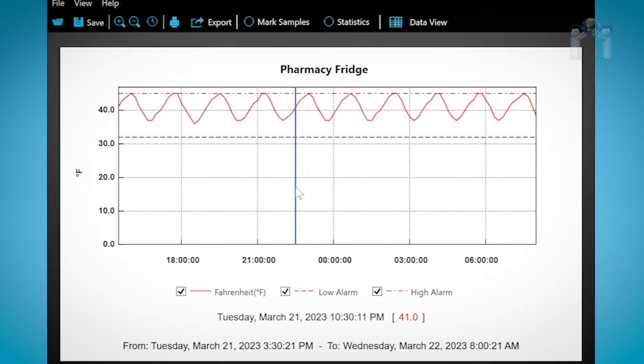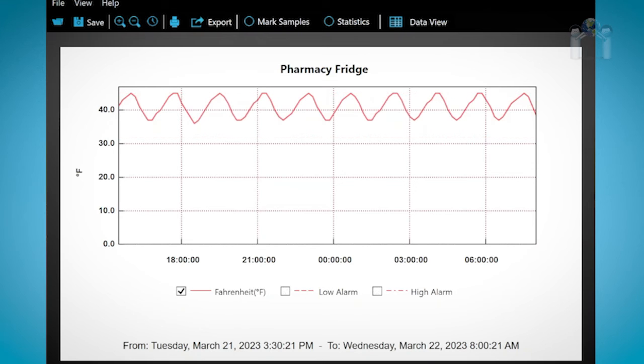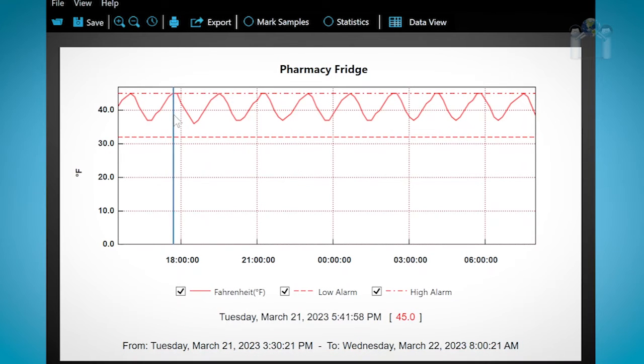After a few moments, a window with a graph will appear. Looking at the graph, you should notice three lines. The two differently dotted lines show the high and low alarm settings. The solid line represents the recorded temperature. At the very bottom, you can see the date and time range the data logger was reading. If you use your mouse, you can scroll over the graph and view the details of the reading at that particular time and date.